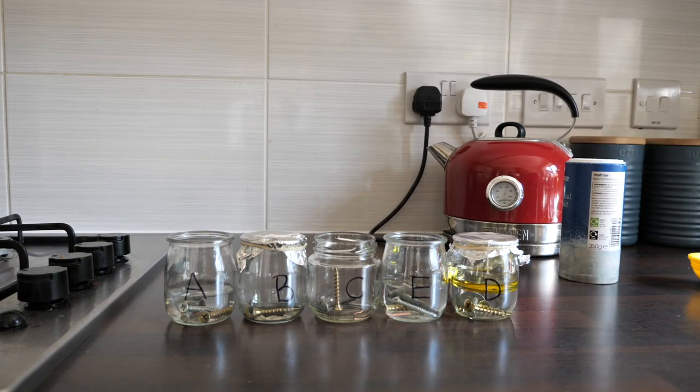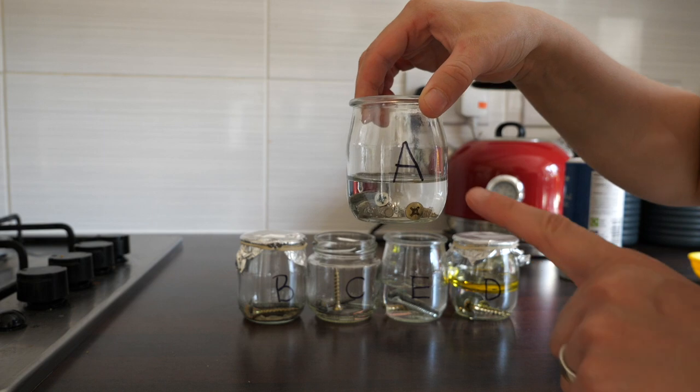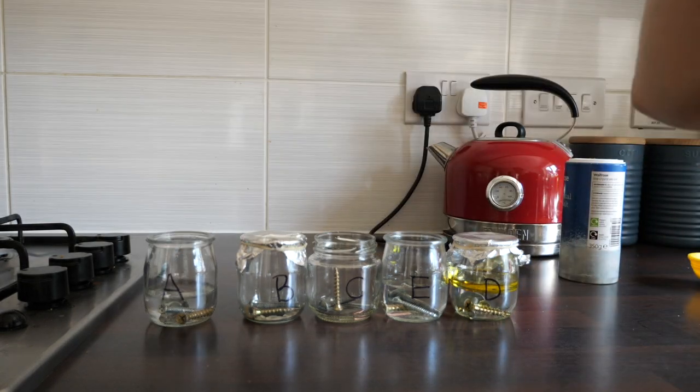So here are my jars that I've set up. I've put one of each different type of screw into the jar. Into A I have put just some tap water, so it's water and because it's tap water it's got oxygen dissolved in it.